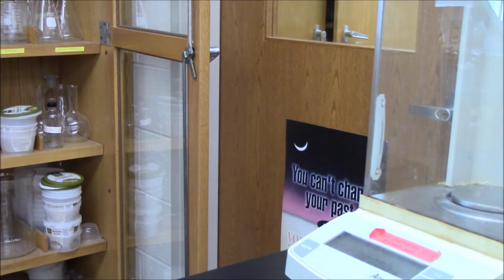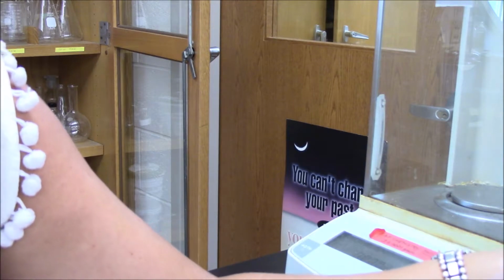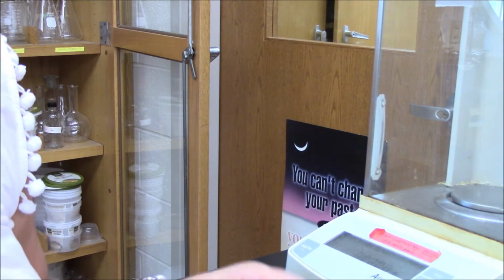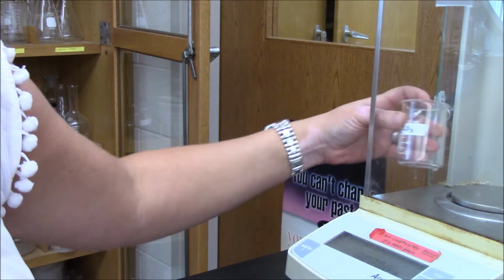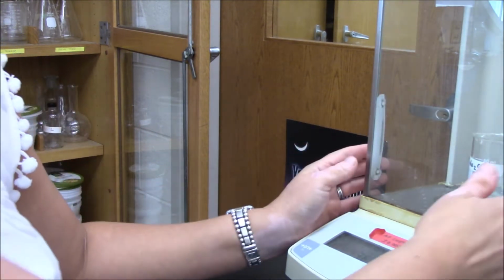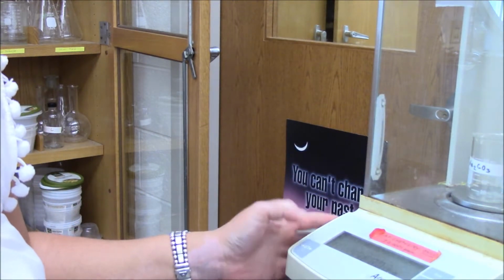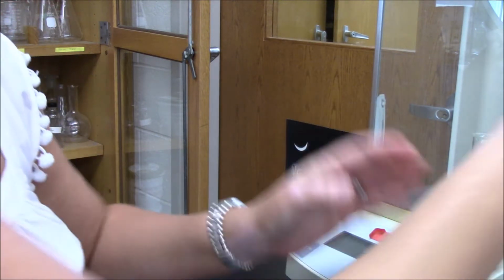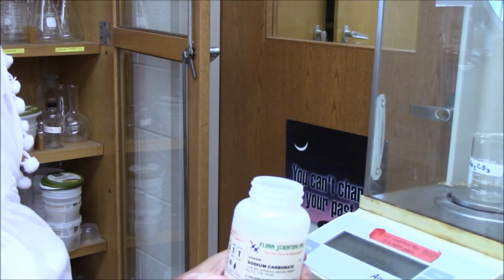At the analytical balance, maybe I can even zoom in a little. What I'm going to be doing here is measuring out the masses. Steps 1 and 2 are asking you to weigh out 2 grams of sodium carbonate and 2 grams of calcium chloride into clean, dry beakers. I'm going to open up the window here for the analytical balance. I'll wait for it to stabilize, and I'll tare it. Then I'll open up the window. I have my sodium carbonate, and I'm going to add about 2 grams.